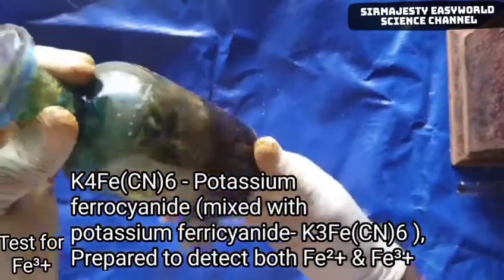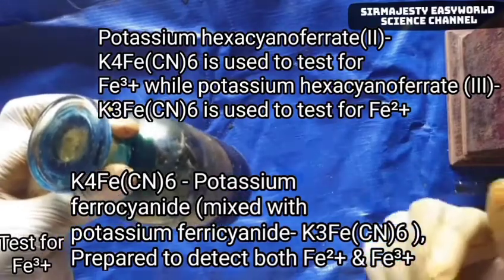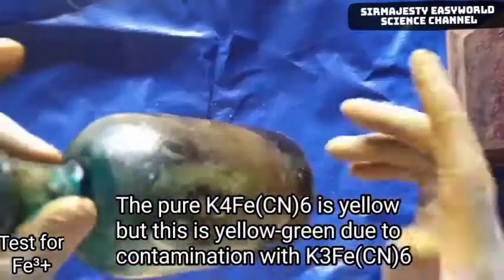This is Potassium Hexacyanoferrate 2. While testing for Fe3+ ion, you use Ferrate 2. But while testing for Fe2+ ion, you use Ferrate 3. This one is Potassium Hexacyanoferrate 2.